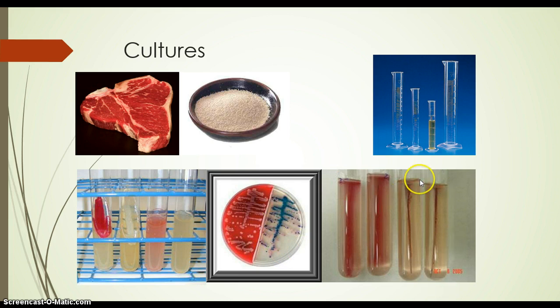you can stab them. We used these for our flagella experiment, and the ones with flagella moved throughout the deeps, and the ones that didn't have flagella stayed where we stabbed them.